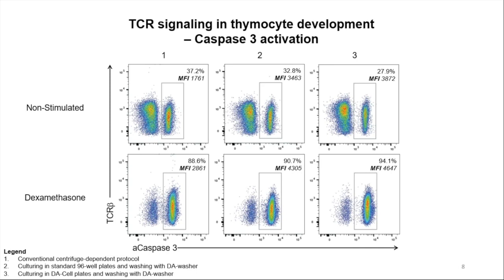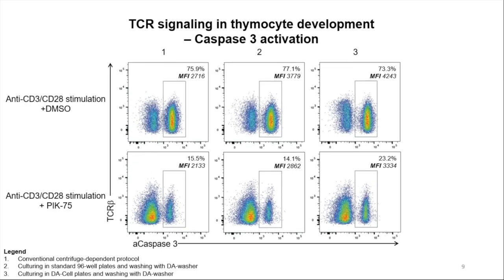And in our stimulated and DMSO mock treated samples, caspase-3 activation was observed, which is a result of stimulation-induced apoptosis.